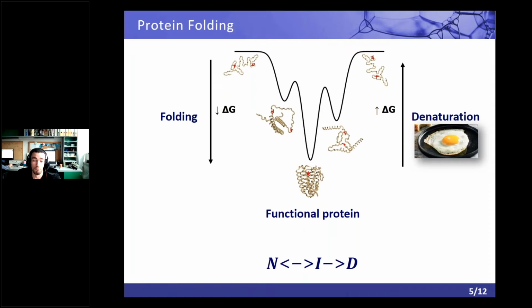So then once we take on this framework, what happens when people want to measure protein stability? As I told you, in general, there are some high resolution techniques, but they are super demanding and they have a lot of different limitations by protein size, or that you need to go to France and book some slot.